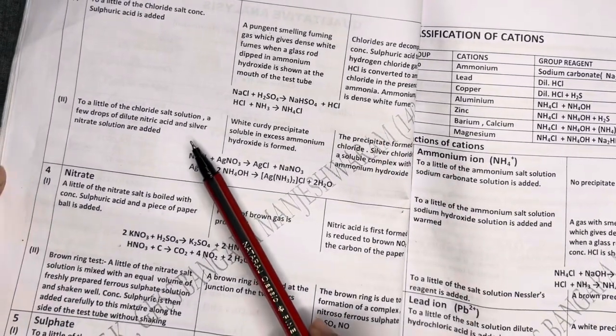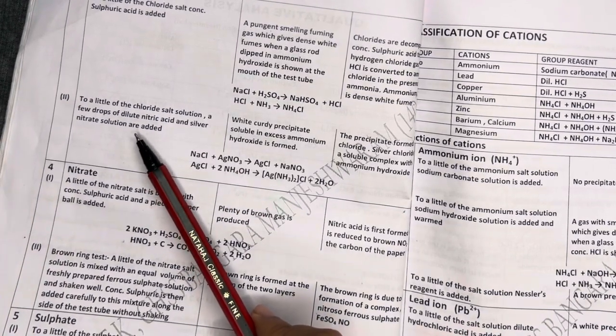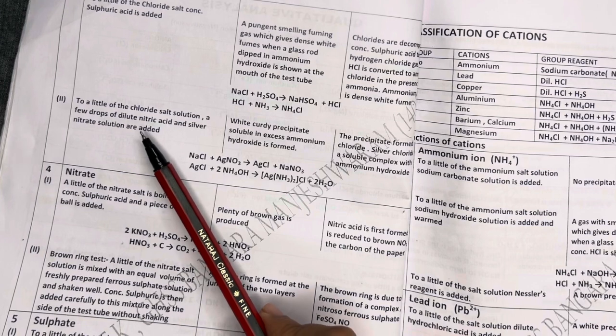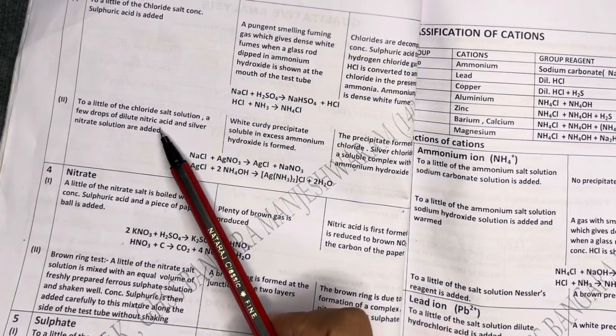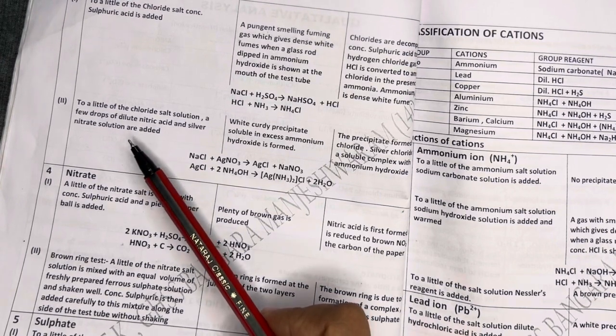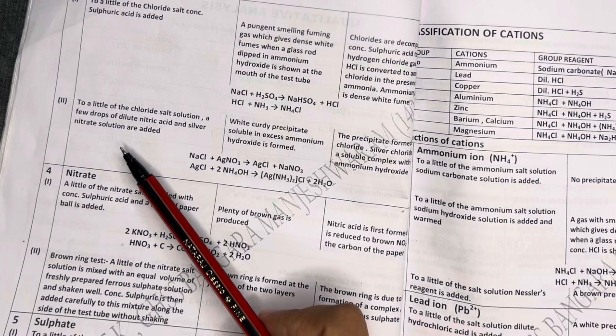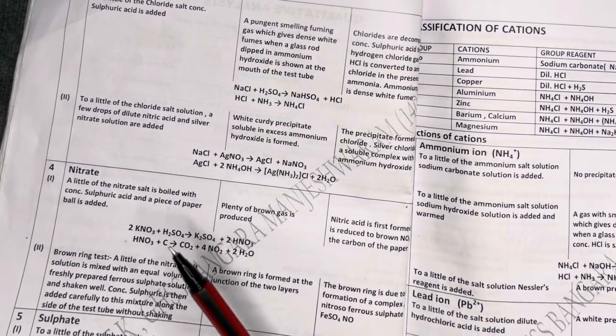And next, to a little of the chloride salt solution, you have to add dilute nitric acid as well as silver nitrate. When you add this, you can see a white curdy precipitate which is soluble in excess of ammonium hydroxide. So it indicates the presence of chloride. That is a confirmatory test for the chloride ion.